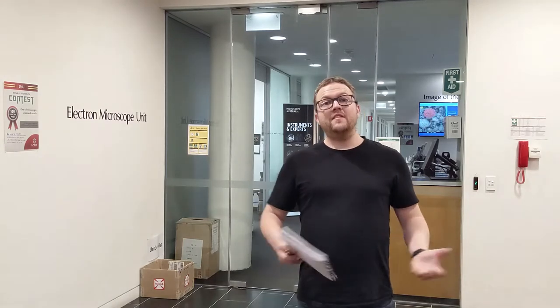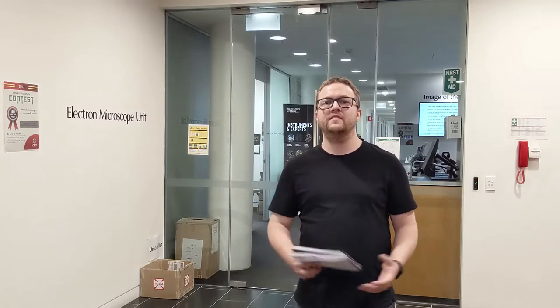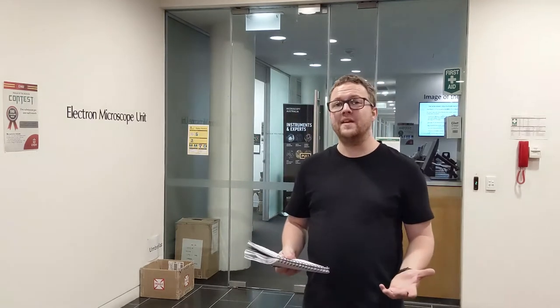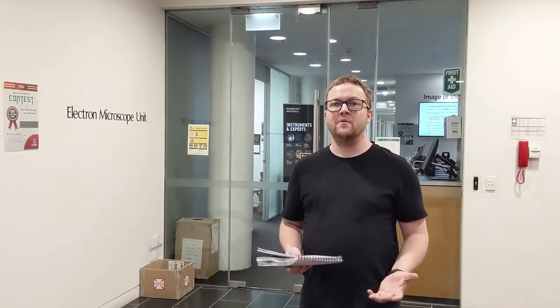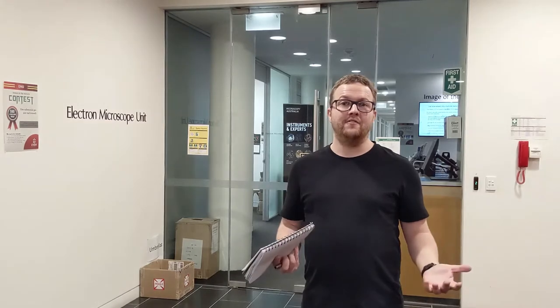The Electron Microscope Unit is in the basement of the Chemical Sciences Building, and we provide electron microscope facilities and expertise to researchers across the university, from honours level students to professors. Today, we will be making a TEM sample with your nanoparticle sample, and then looking at it under the microscope. So, let's get started.